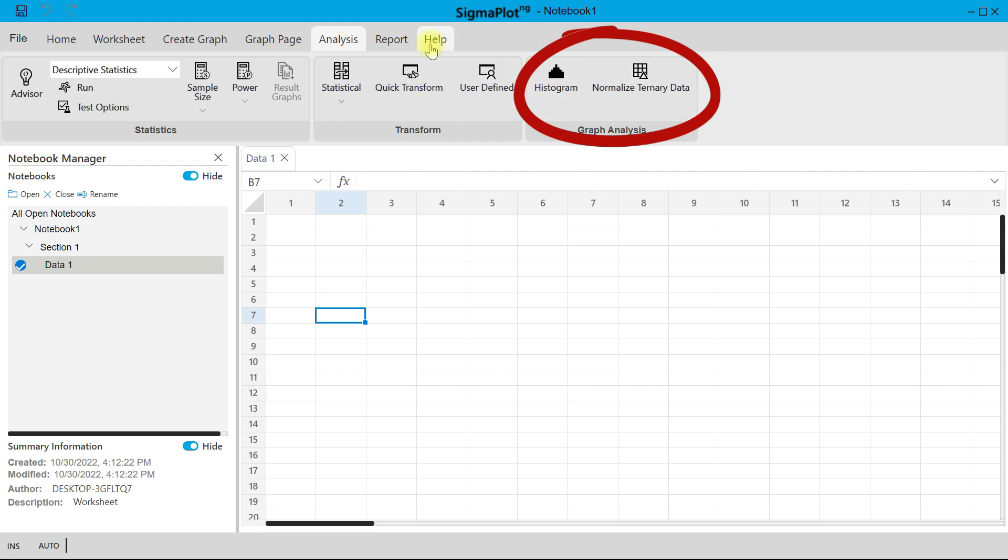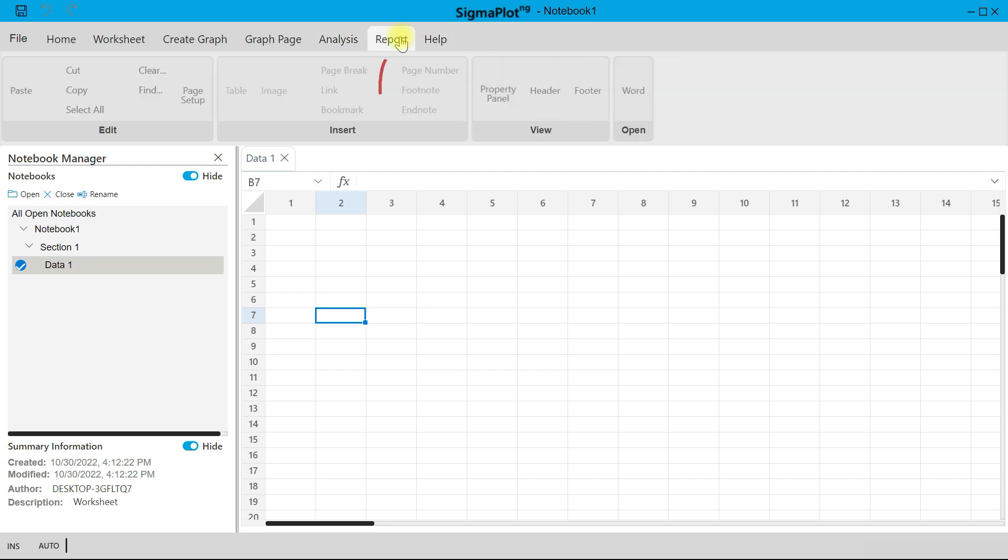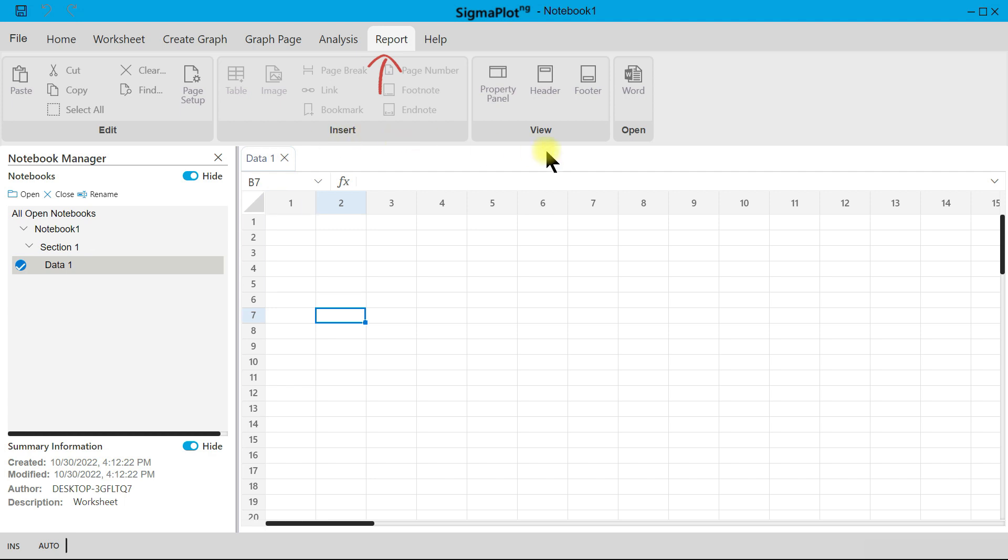Then you also have the Report page. So on the Report page, what you can do is once you have a report, typically from your statistical data, you can just come in and customize it as well. You can copy, you can use it, and then you can also change the view accordingly.